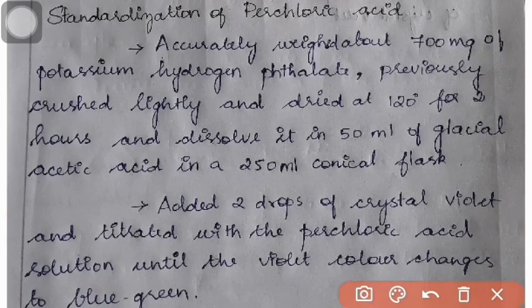So here potassium hydrogen phthalate is used for the standardization of perchloric acid.